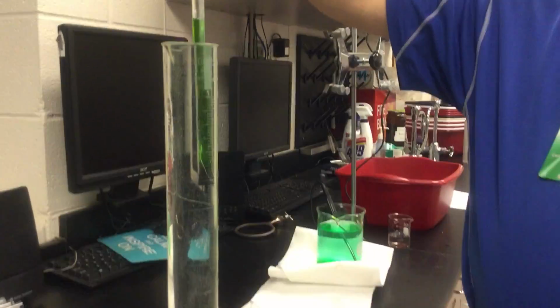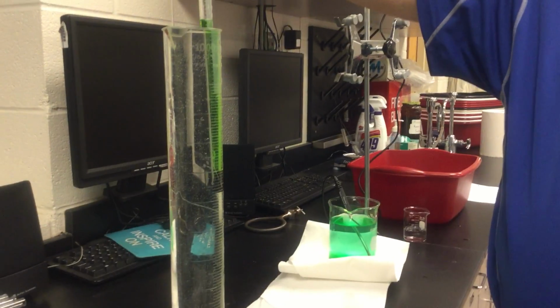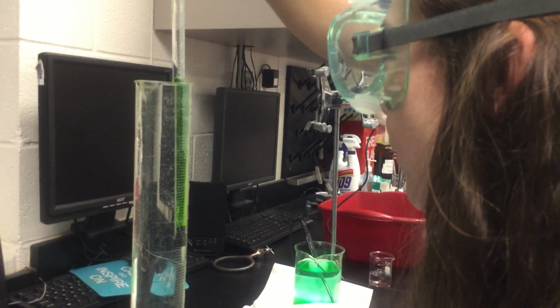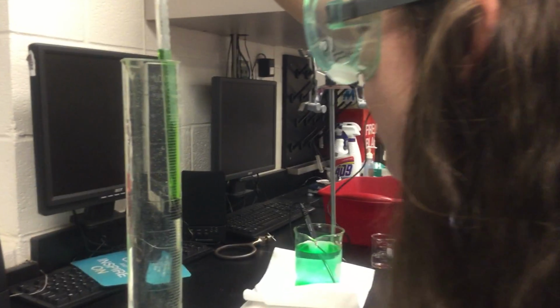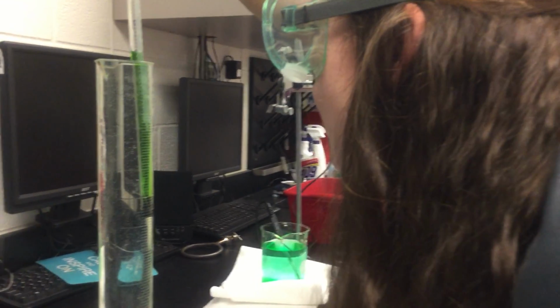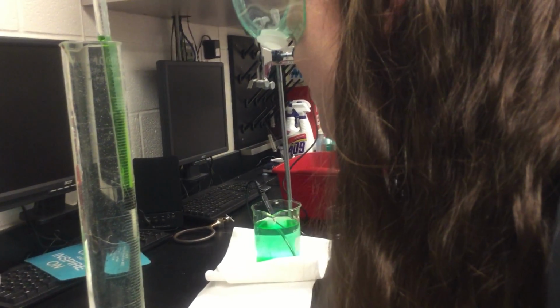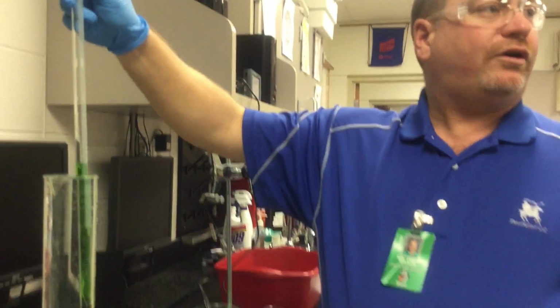Not Kyle, somebody else. Okay? I want you to look. What am I reading about right here? 42. Okay? Oh, wait, no. 41 point. It's going the other way. It's going down, so that's 40.8.